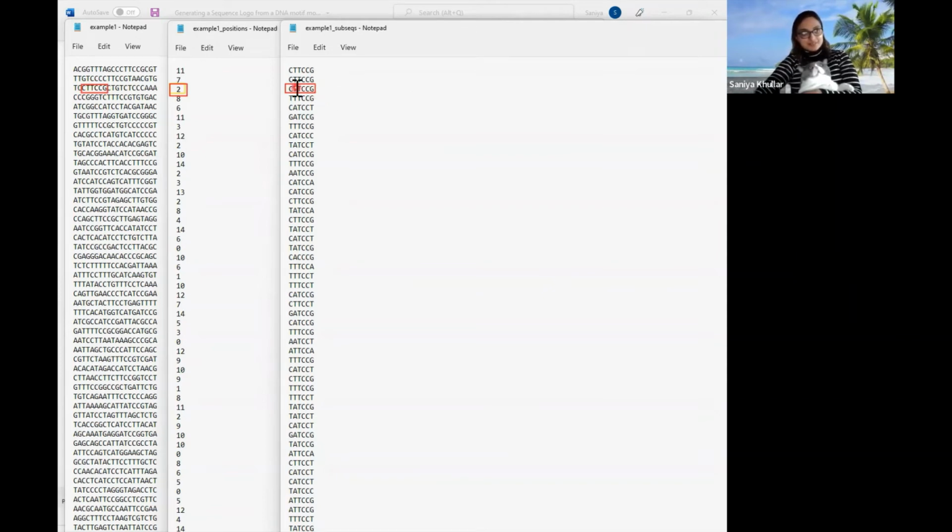So in the end, we extracted this position here, which just means 0, 1, 2. We start here. It doesn't really impact it much. We just need to know what the indexing starts at, but don't worry about the technicality. The bottom line is that the motif that we learned is C, T, T, C, C, G here. Again, in this other example, if we look at this one here, we need to start at 0. T, T, T, C, C, G. That's what it is.